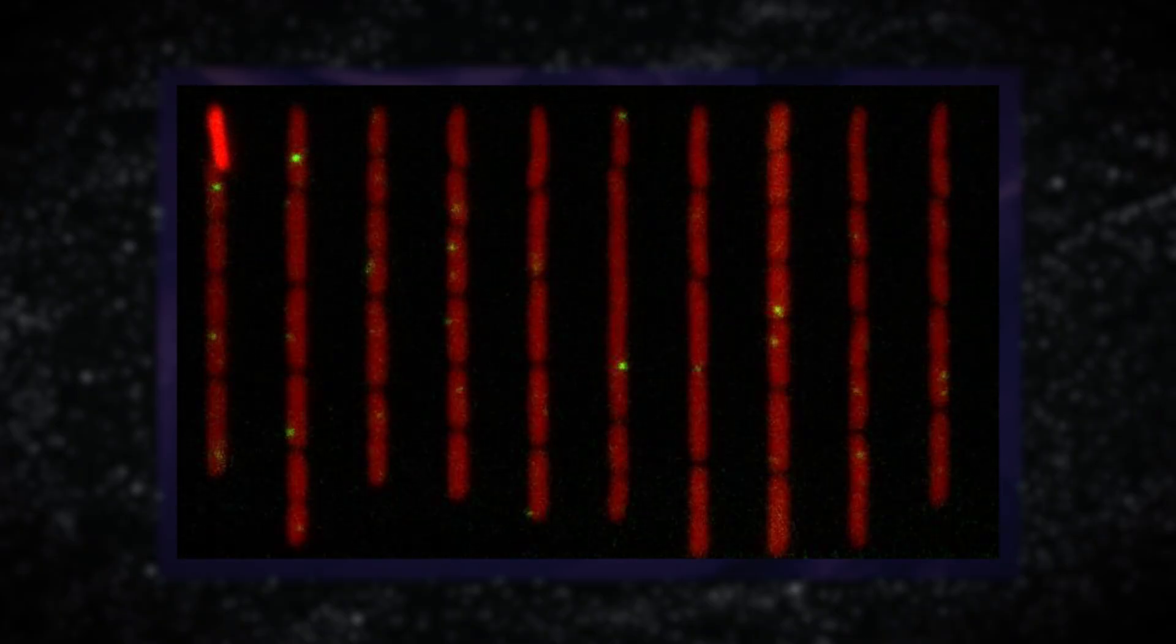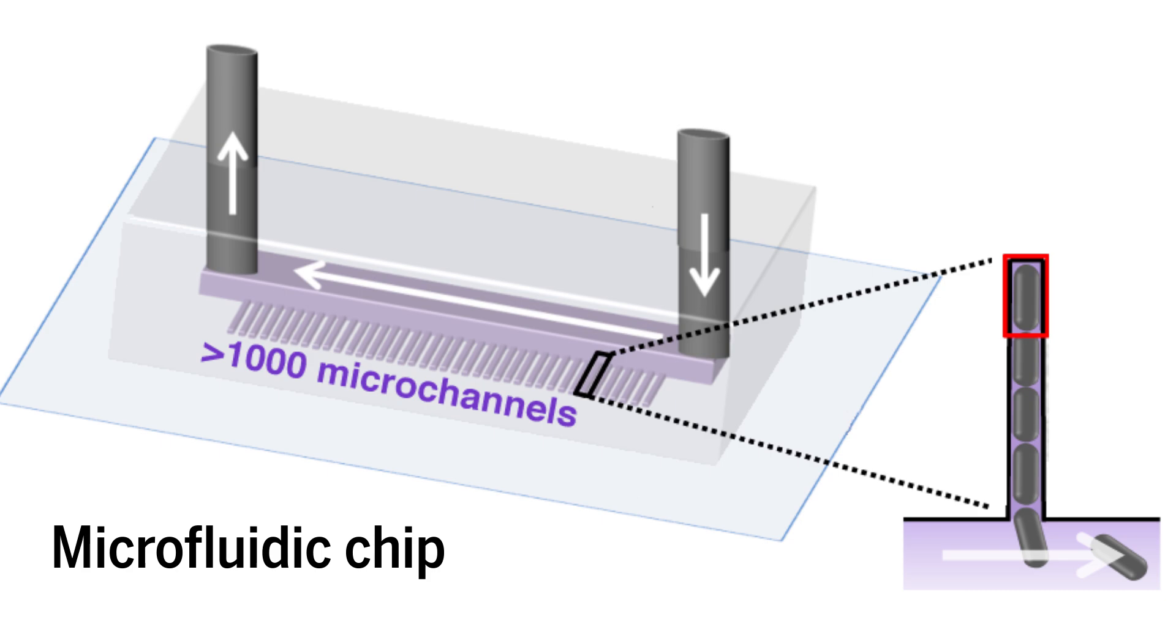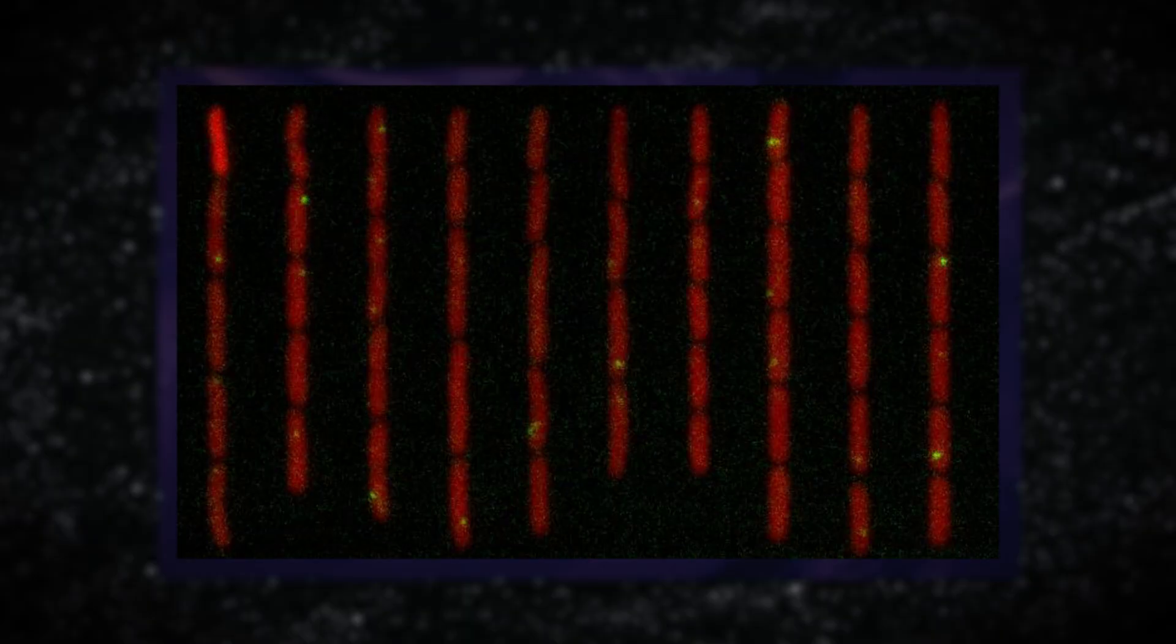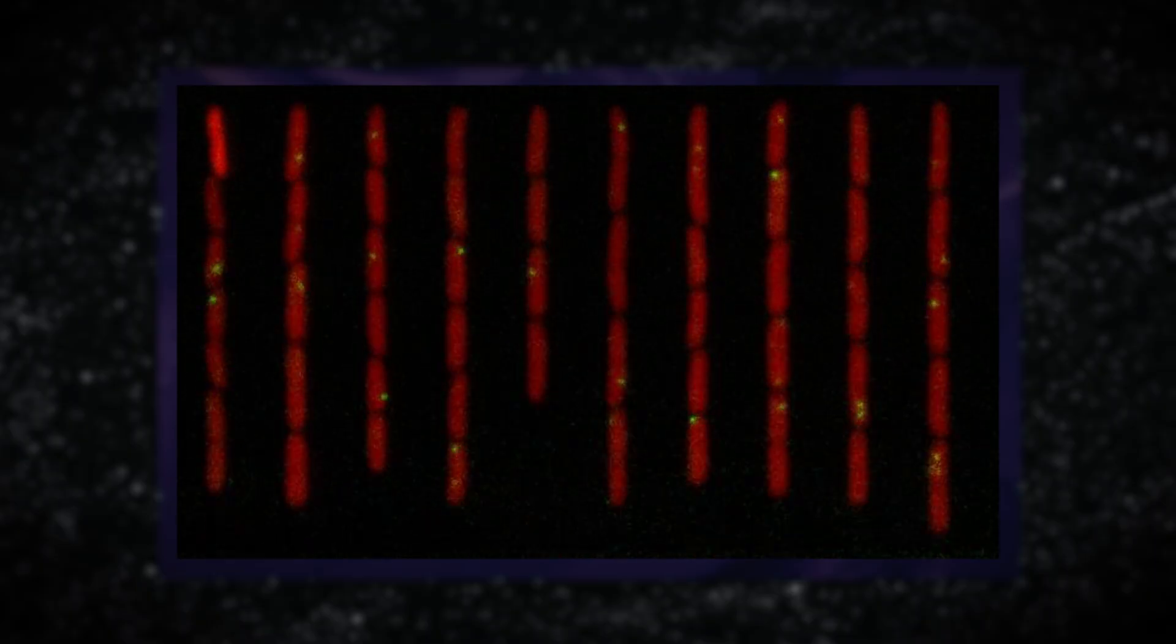In this view, the mother cells are along the top of a microfluidic chip, so named because narrow channels control the liquid's flow in very specific ways. The offspring bud off and expand into the tiny tubes, each cell pinched off from its progenitor. Newly made cells are whisked away by liquid at the bottom of the tube.